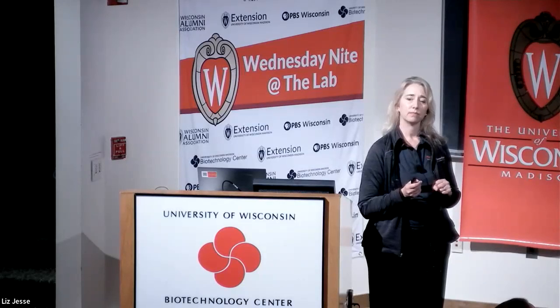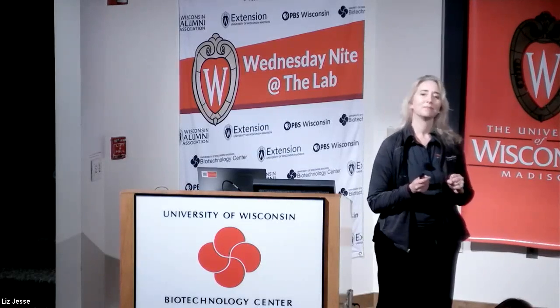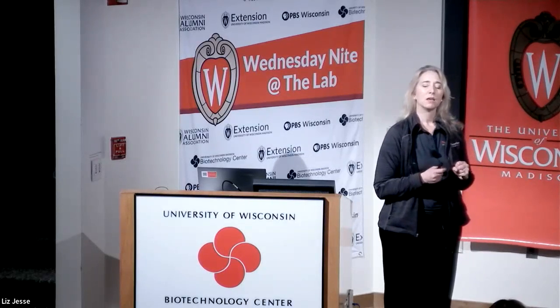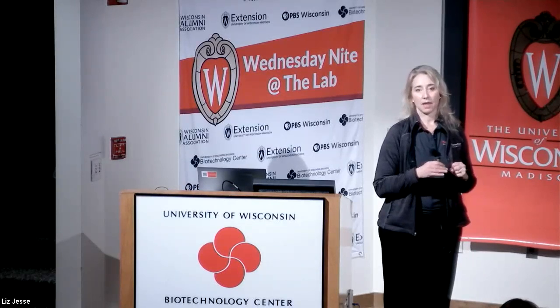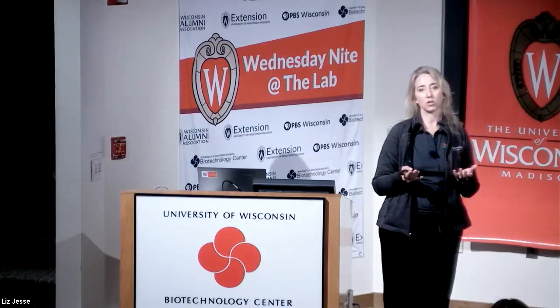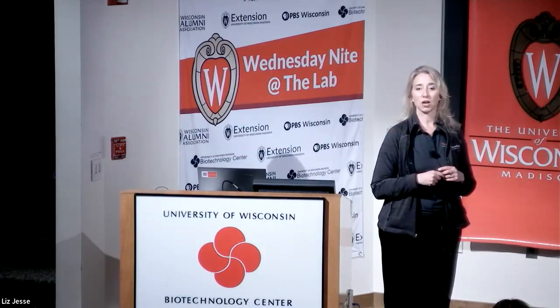We do have the problem of the fluorophores bleeding into the other ones. Should I expect any such bleed-through issues? So there is some analysis of that, and we have algorithms that apply. So yes, you do have that, but we have a recommendation of several targets that work well together. And then we can talk about that afterwards.